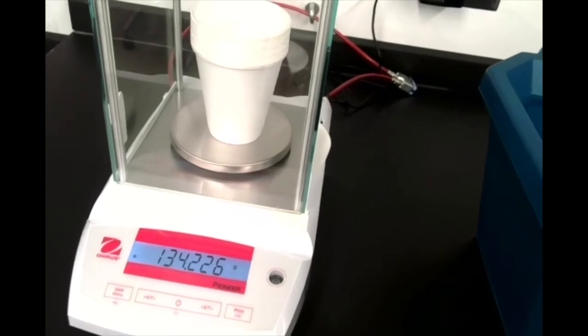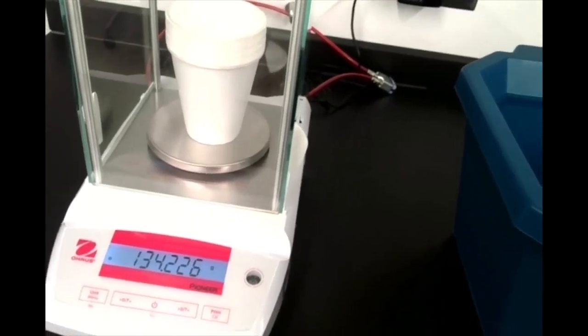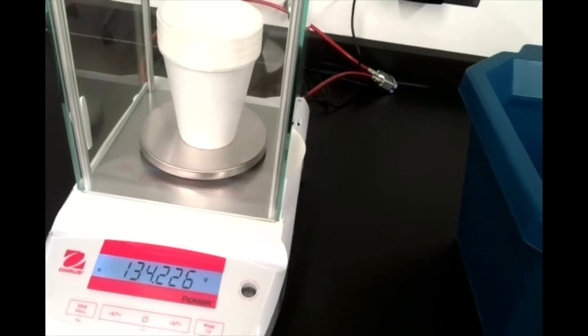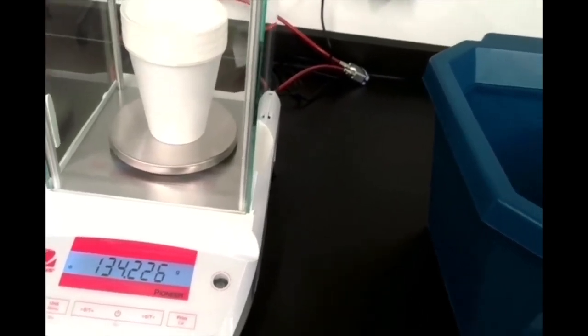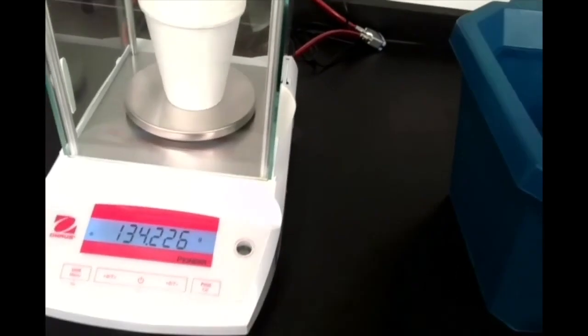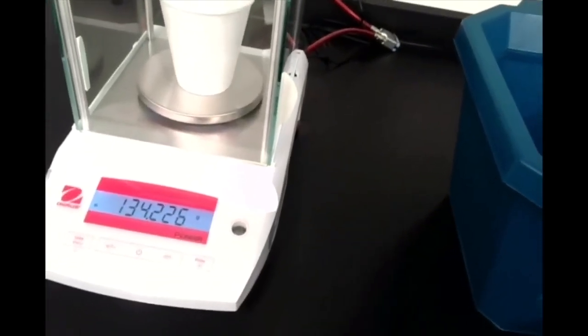Okay, based on that, you should be able to figure out how much ice melted and, from the temperature change, figure out how much heat went into cooling down the water, and realize that same amount of heat went into melting the ice.